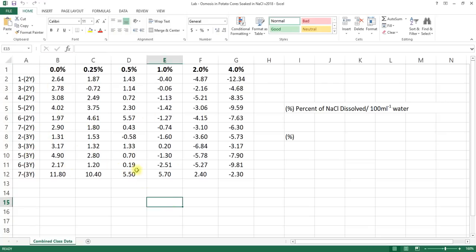The reason I'm doing it all like this is I not only want to teach you how to make your graph, but I want to teach you how to make a table. After all, we are in this class and we're going to try to learn how to use this data processing software for future labs. And as frustrating as it is, follow very closely.